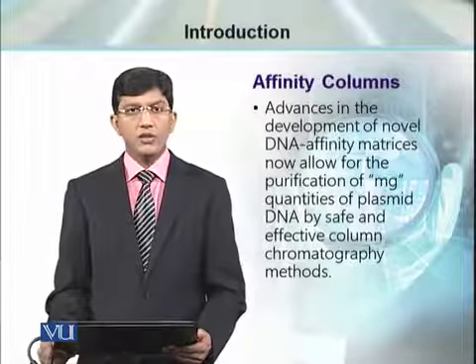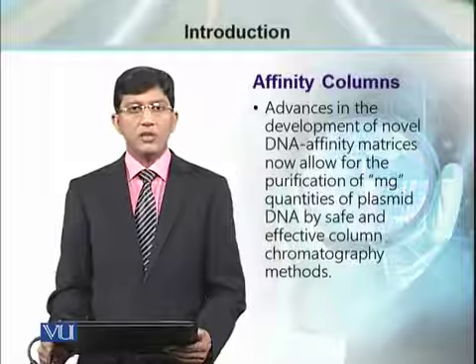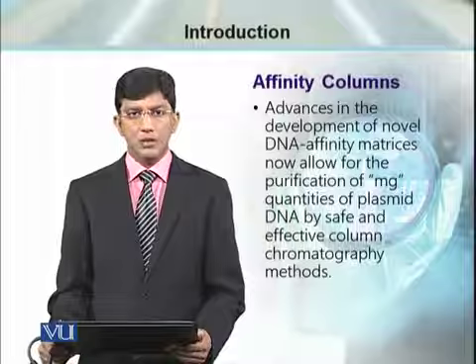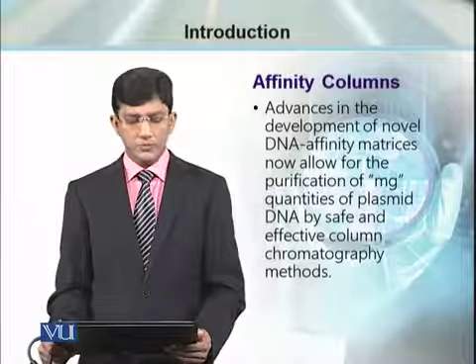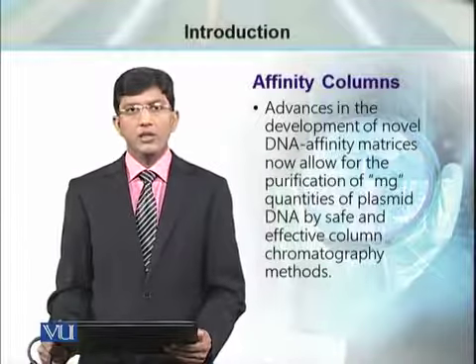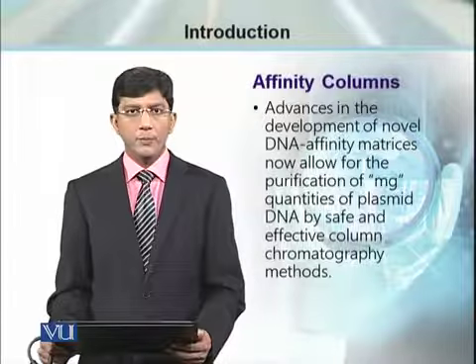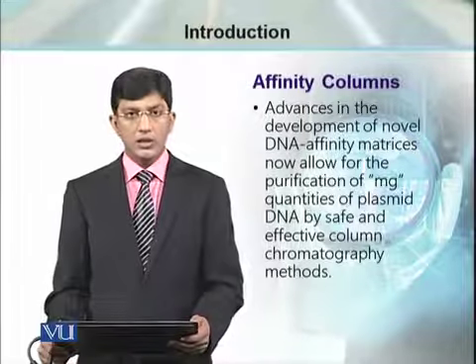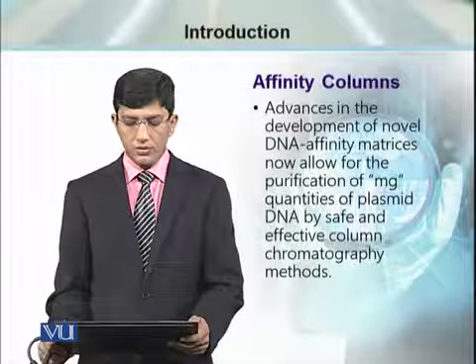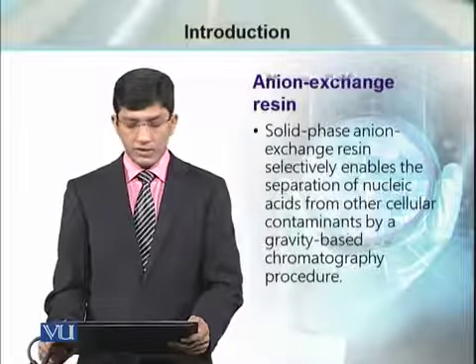After the advancement in the molecular sciences, columns have been developed which are known as affinity columns. These columns have affinity to bind to charged particles because they contain some resins, and while using these resin-containing columns, we can easily purify the plasmid DNA from the cell suspension, from the lysed cells.